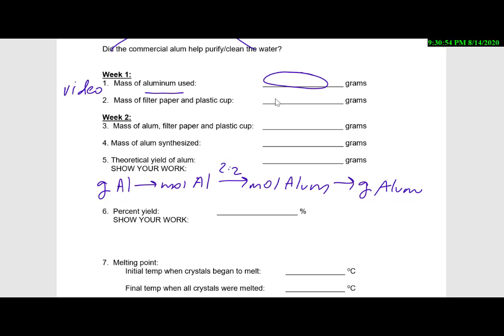You'll also be given the mass of an empty filter paper and cup, and then also the alum filter paper and cup so that you can subtract. So you'll subtract these two to find how much alum you actually made. This will be your actual yield.